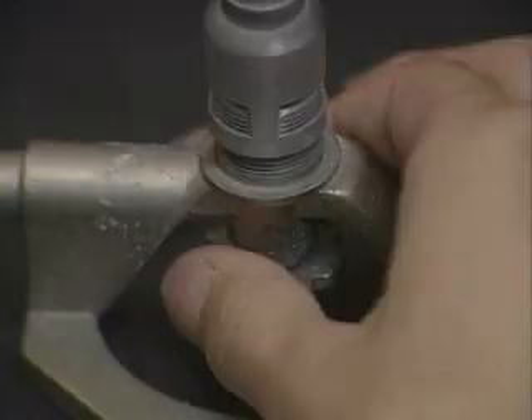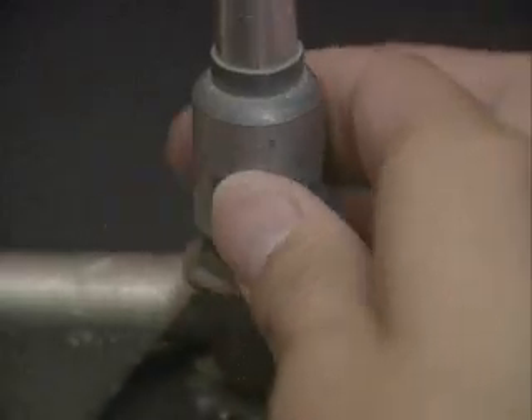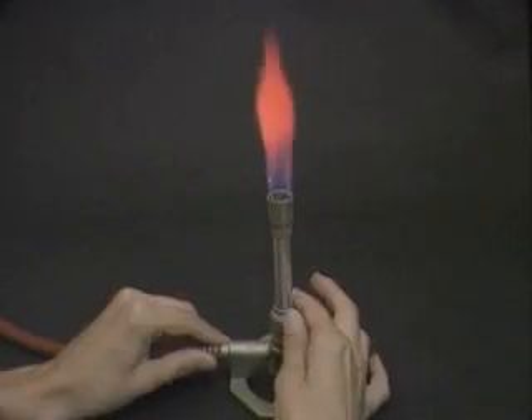Use the gas control needle valve to control the height of the flame. Adjust the air control vent until the flame has two or more blue cones and a slight buzzing sound is audible.